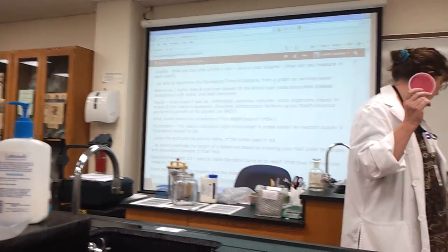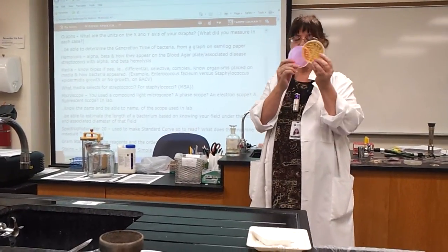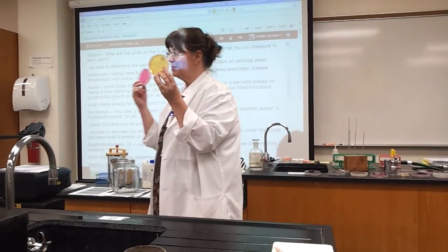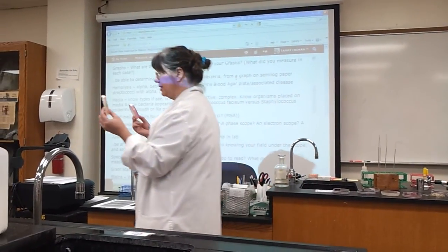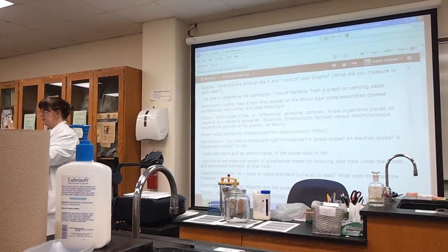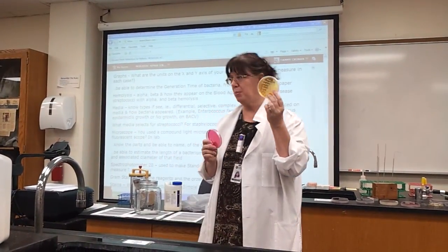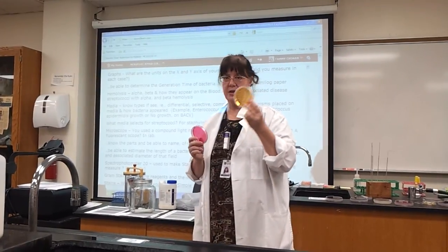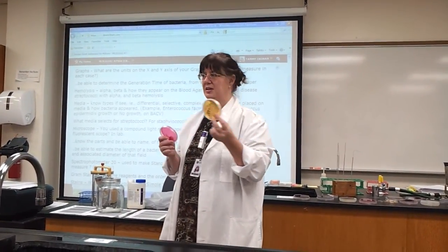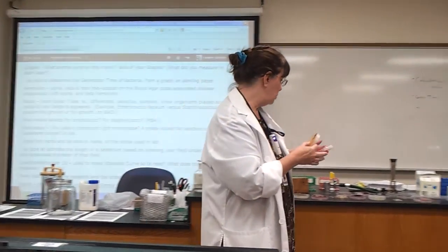Well, also had, this did not come from a culture I gave you, but from a body. This has to be, again, a staph because this media is complex or selective? Selective. The salts make it select for staphylococci. Now this is a staphylococci too. You see the difference? This one is epidermidis. Who is this? Probable Staphylococcus aureus. You don't have to say probable, but in reality it's presumptive Staphylococcus aureus. Staphylococcus aureus can be a wound infector.